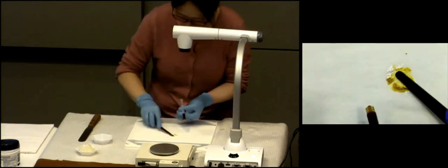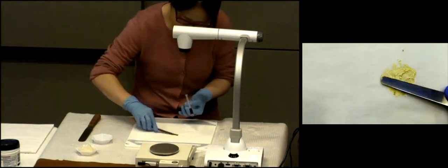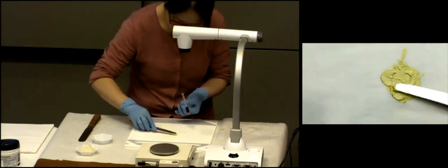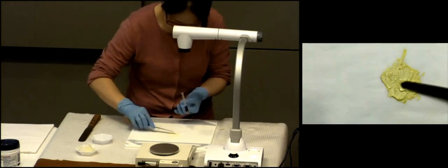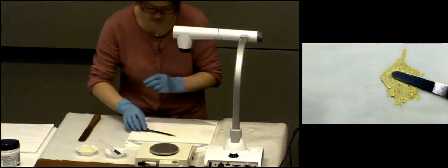See where it still looks a little flaky? Powder chunk. So go ahead and write this in the margin. This will definitely be a big thing for your wet lab in a little bit, because you're going to have to figure out yourself when to stop levigating. What we want is a 3-word description of what it looks like when it's done. It should be shiny, sticky, glob. You want a shiny, sticky glob.